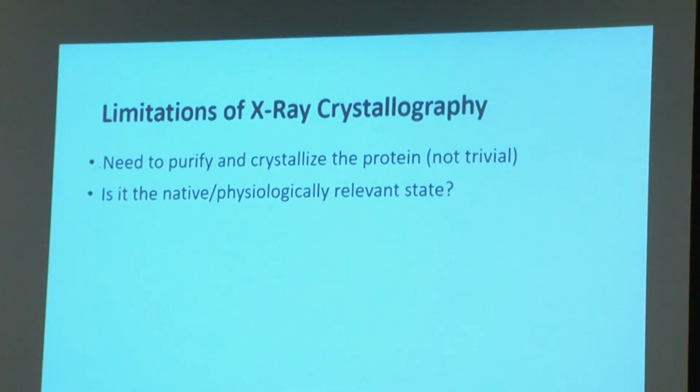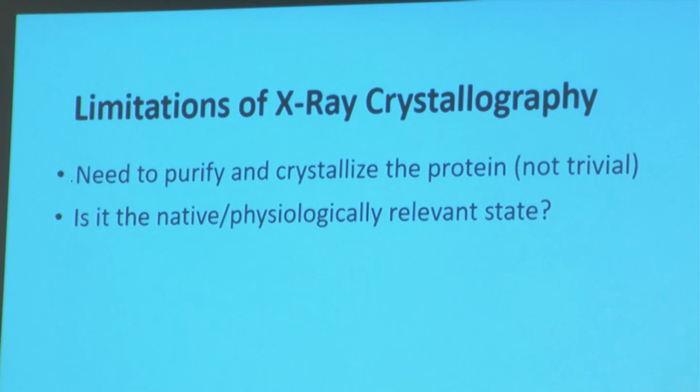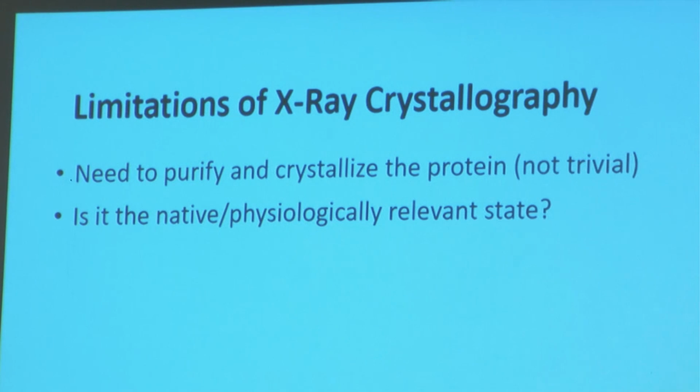Anything else? Yes? The crystals you get may or may not be physiologically relevant. Yes, absolutely. But it's hard to tell whether the crystal structure that you get is depicting what's happening with the protein in vivo. And this is a problem that's inherent to X-ray crystallography, right? Every time you solve a crystal structure, you don't know whether it's relevant. But usually it turns out that it's pretty close, if not completely accurate in solution. But sometimes you do have to be careful about this. It's especially challenging for things like membrane proteins. Any other ideas?